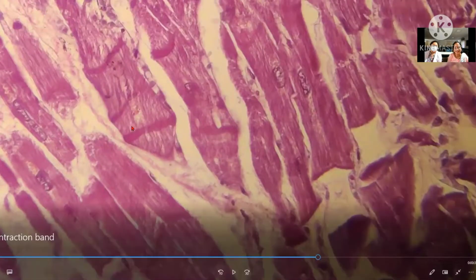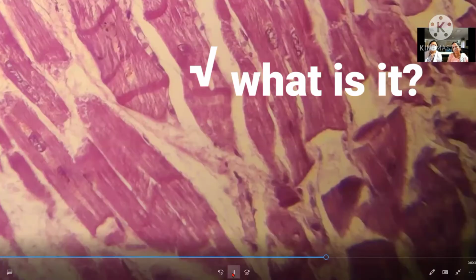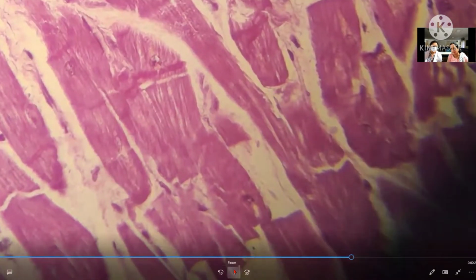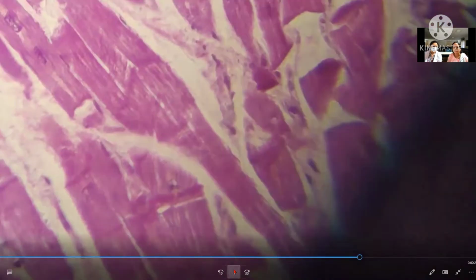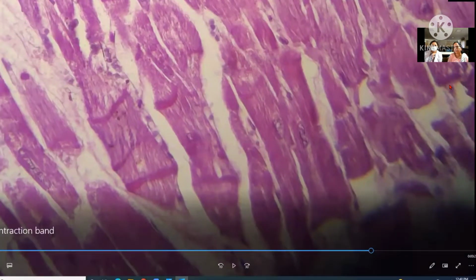Let me pause here. Very nicely, we can make out the cross striations of the myocardial fibers, and this is what made us stop here. Exactly, this is the observation. Just 1 minute. We are seeing the microscopy. I think that should be fine, right? Yes, ma'am. We'll see some more pictures.